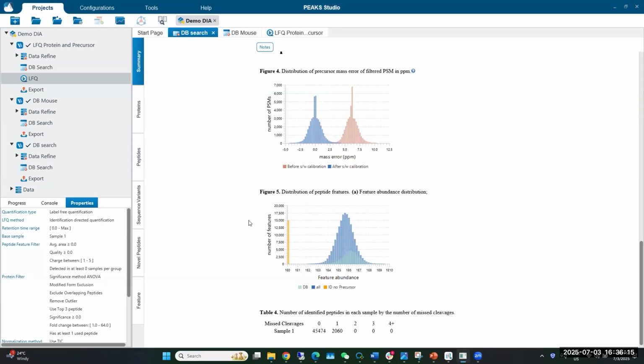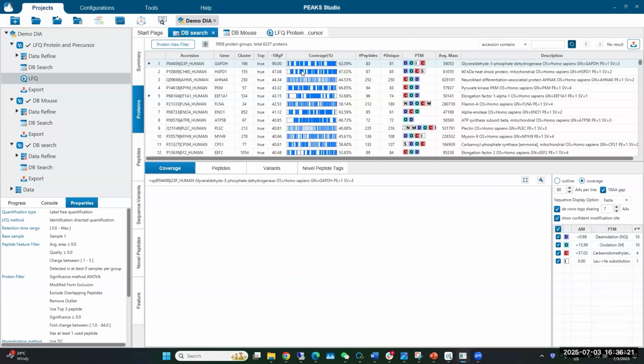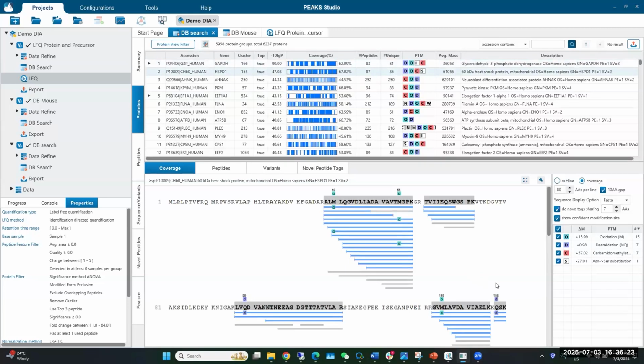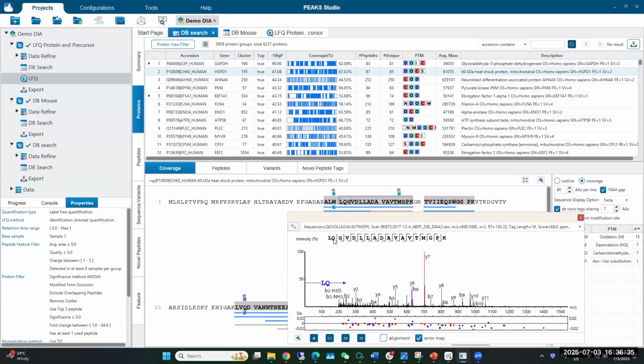Say we have this protein tab, and this gray bar shows there are de novo peptides mapped here. From A R to Q they match exactly, but some of them don't match very well, right?